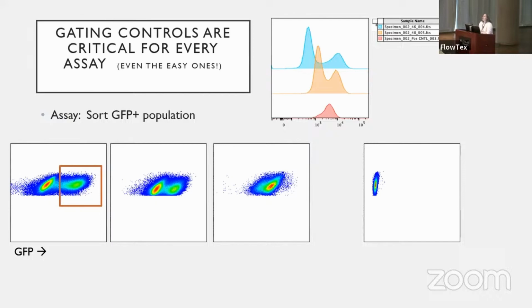Bingo. Did anybody hear? So she said transfection didn't change it. So in other words, did this unstained control have no transfection and therefore was less autofluorescent? And therefore, this is the real autofluorescence of a GFP negative. So what do I need to ask? I need to ask, did this one get transfected? Did it get transfected with an empty vector that doesn't have GFP?